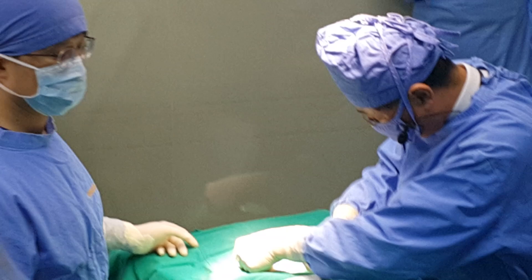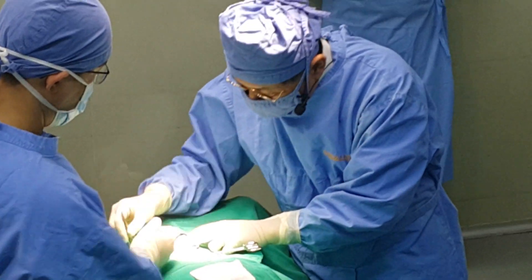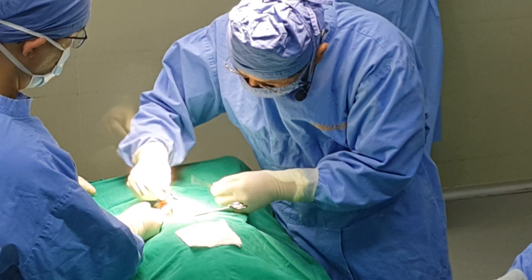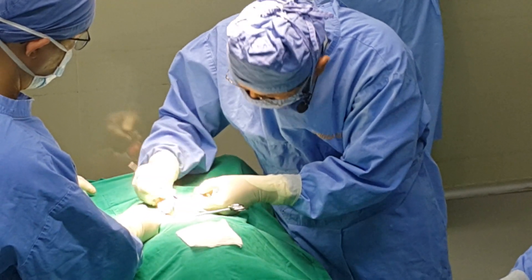We're going to transplant the embryos into the left side of the oviduct.